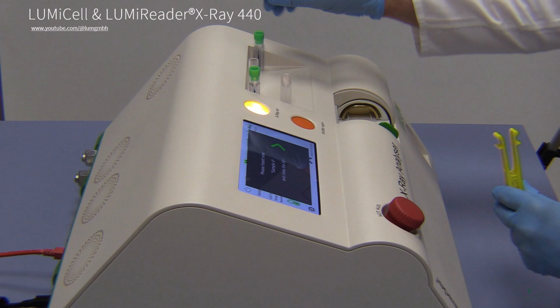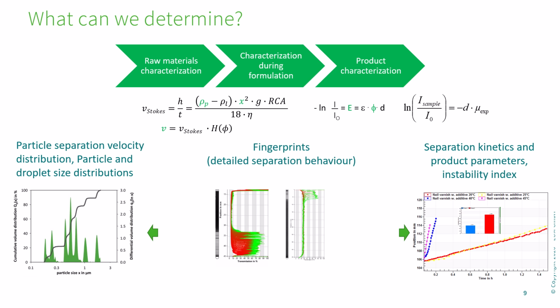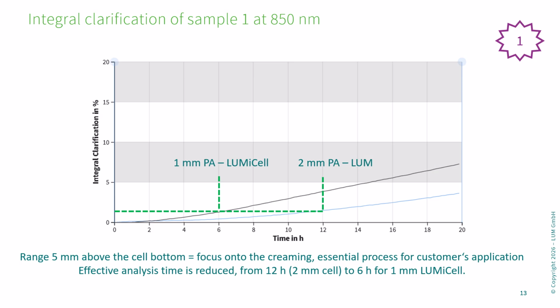Follow the instructions on the screen. We'll start according to your application. Sediment height, for example. By using 50% shorter optical path length, we reduce the necessary analysis time by 50% from 12 down to 6 hours.